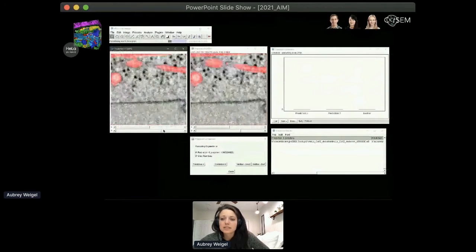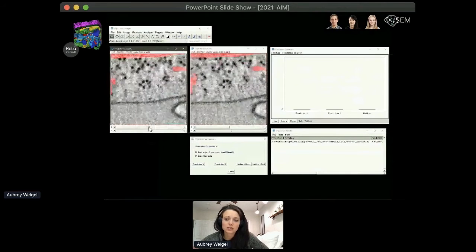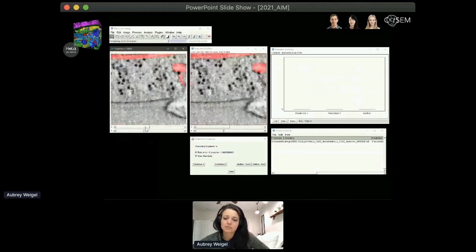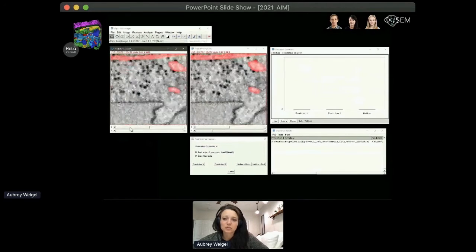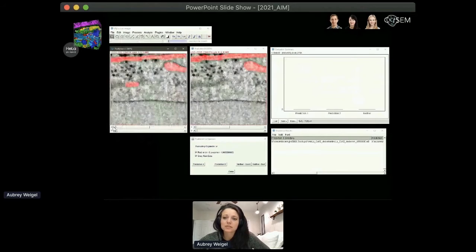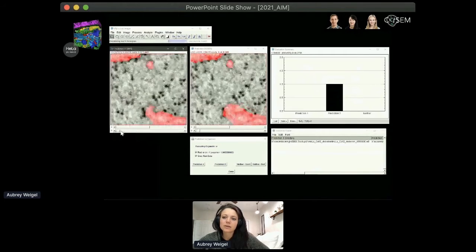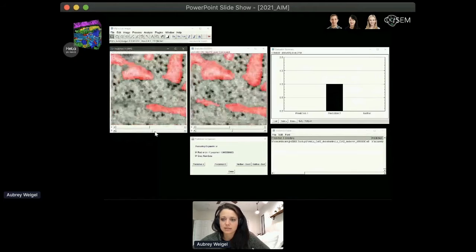To perform these, David implemented a custom Fiji plugin for us to pairwise compare two different predictions at a time. First, the user selects the two predictions to compare, as well as the organelle class that they want to evaluate. I'm showing the ER here. As the movie is showing, a random crop is then chosen from the volume, thresholded at a distance of 0, and then overlaid on top of the raw data.